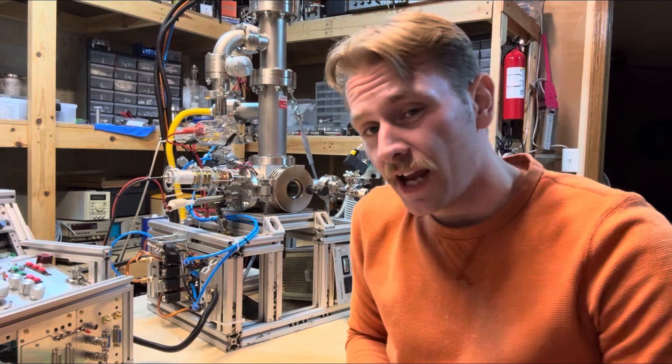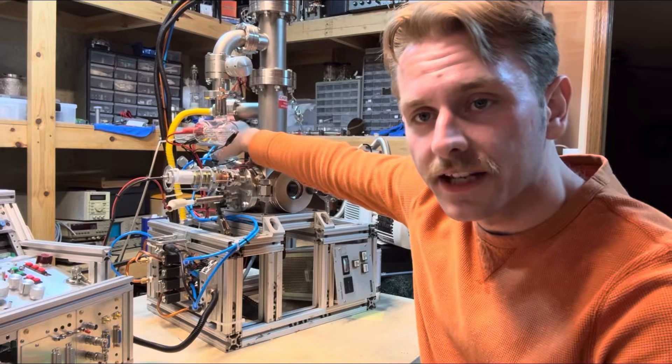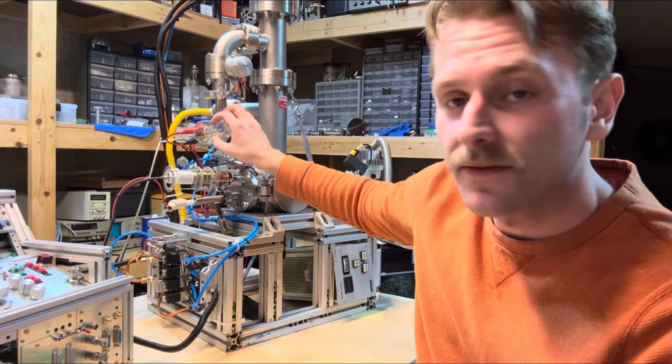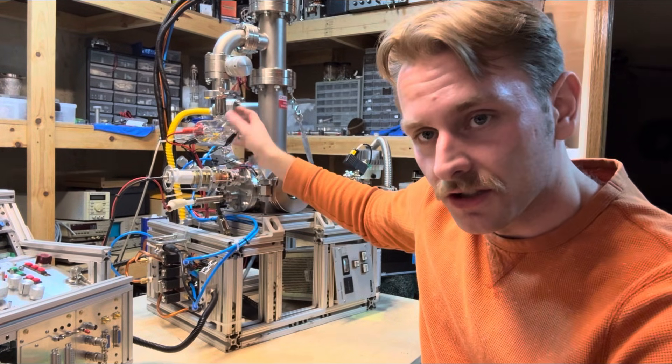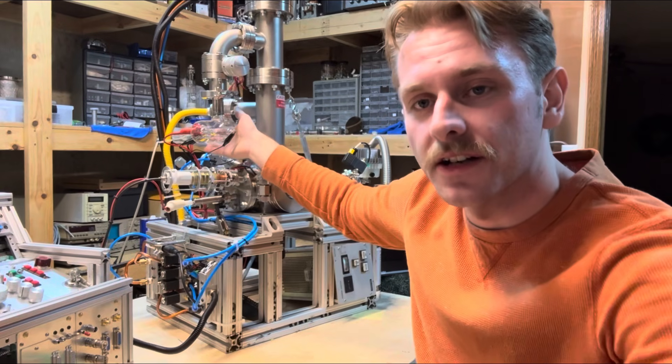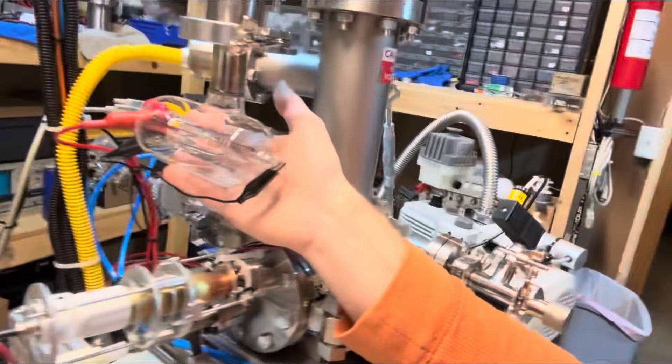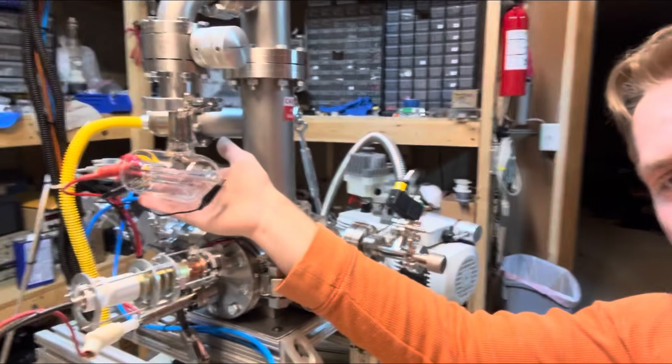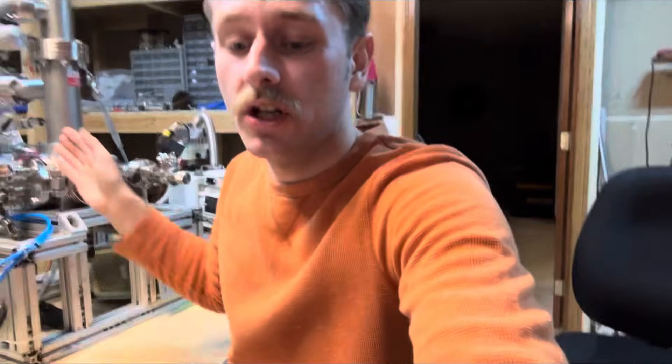To measure the vacuum level, there's two gauges. So I got a Pirani gauge back here. And then here, this is a vacuum ionization gauge. It's like a glass ampoule. This is like one of the coolest looking contraptions that I have in my shop. I love this thing. It's actually called a Bayard-Alpert nude ion gauge.